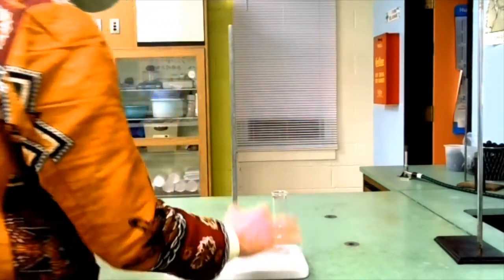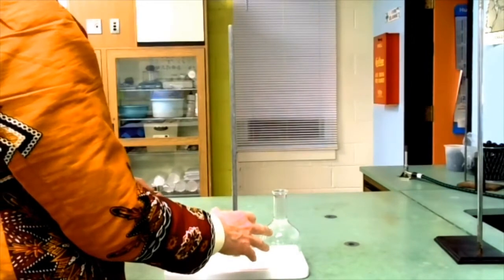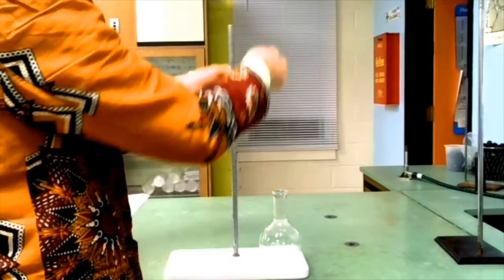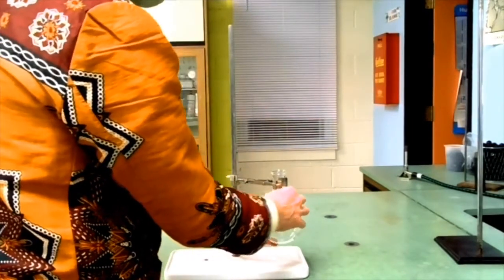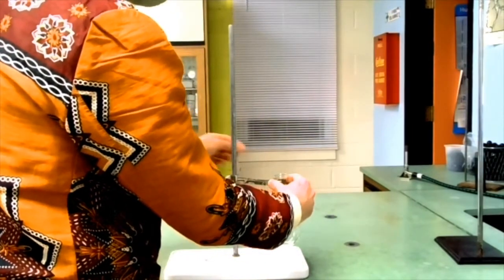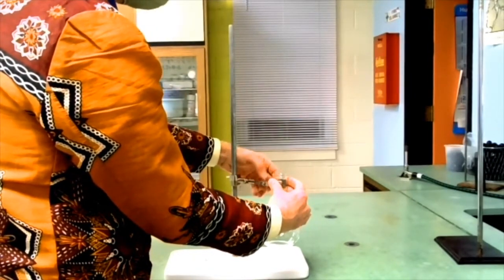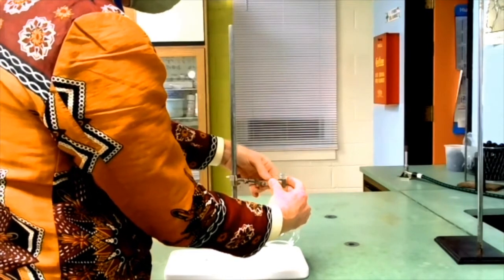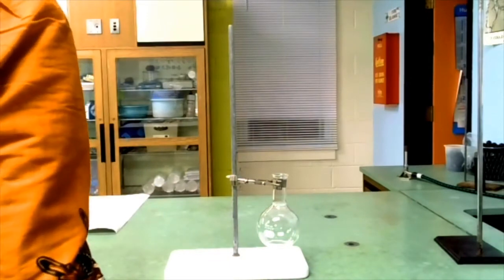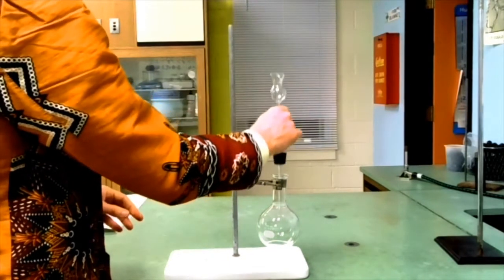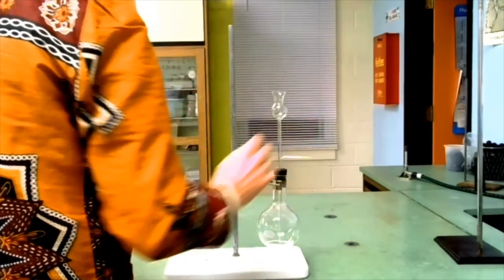First I need a clamp for the 500 milliliter flask. This is the flask that we're going to generate the carbon dioxide in. I want it a little bit off the ground. I'll tighten the clamp so that holds it nice and securely. And the thistle funnel is going to go in there.